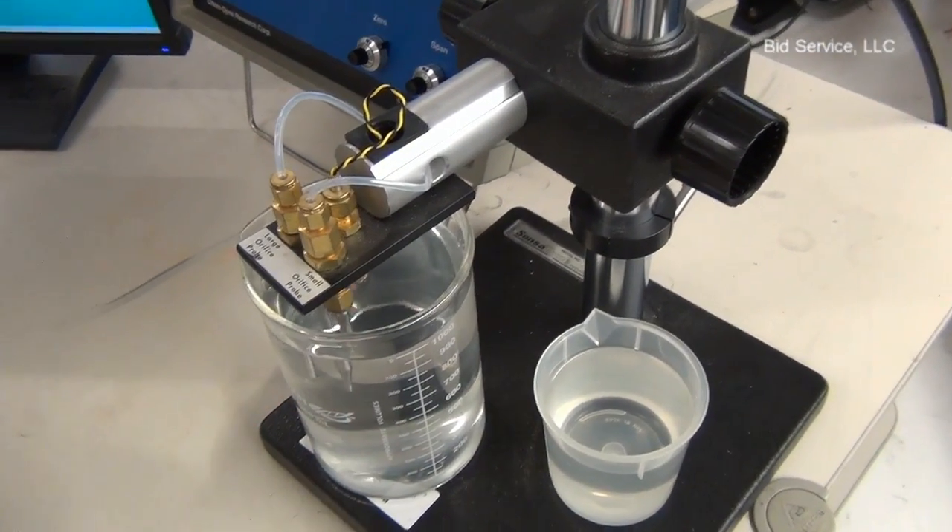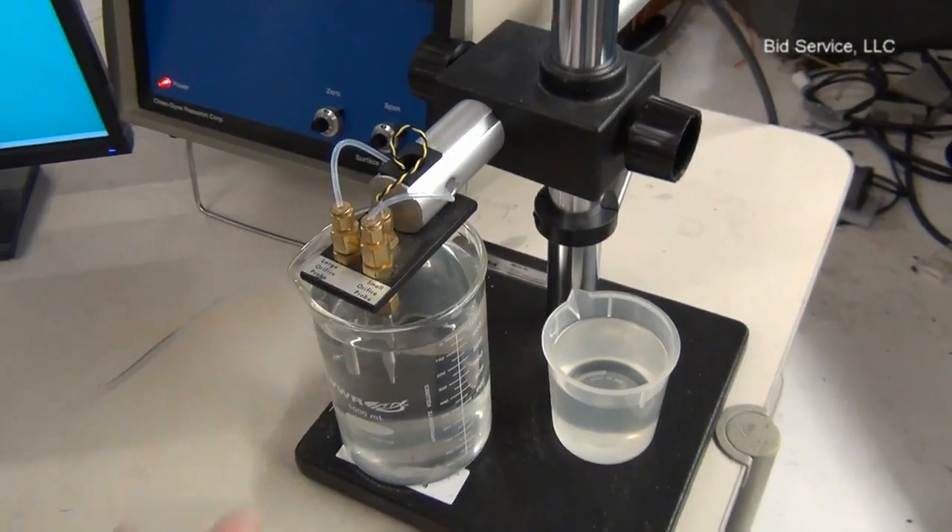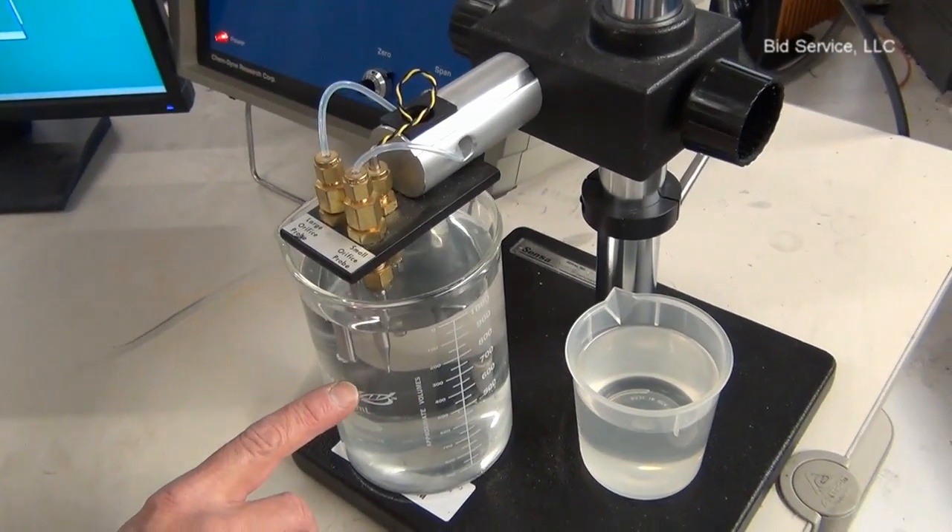Here I have a beaker of water with two orifices, large and small. This is a 4mm and it's a 0.5mm.